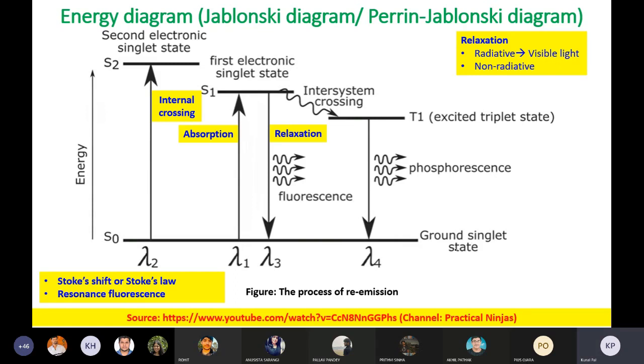Now, in this ground singlet state, you will have several vibrational levels, which I have not shown here to make the system easier to understand. So let us consider that all the ground states are accommodated within this S0 level.